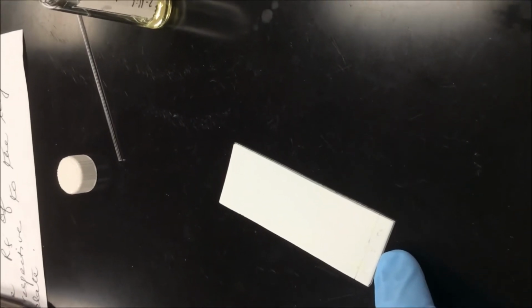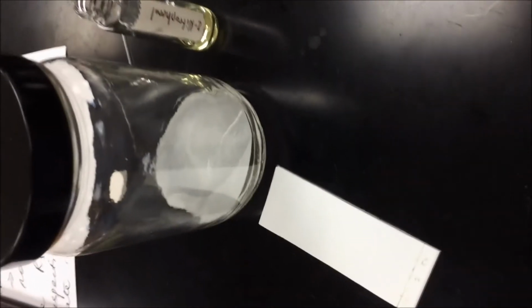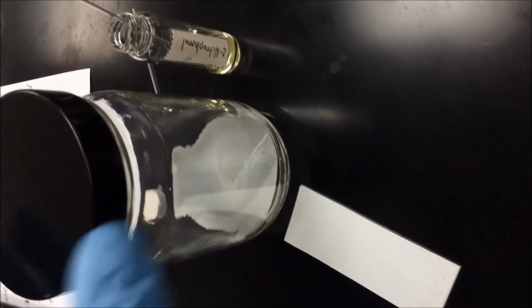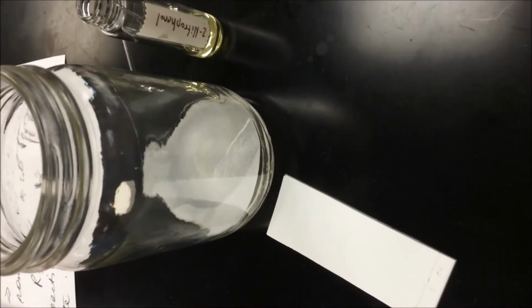And now I'm going to simply put it into a TLC jar, which can either be an actual TLC jar, or it could be a beaker with a watch glass. It could be something like that. In that, I have already poured 5% ethyl acetate in hexane.